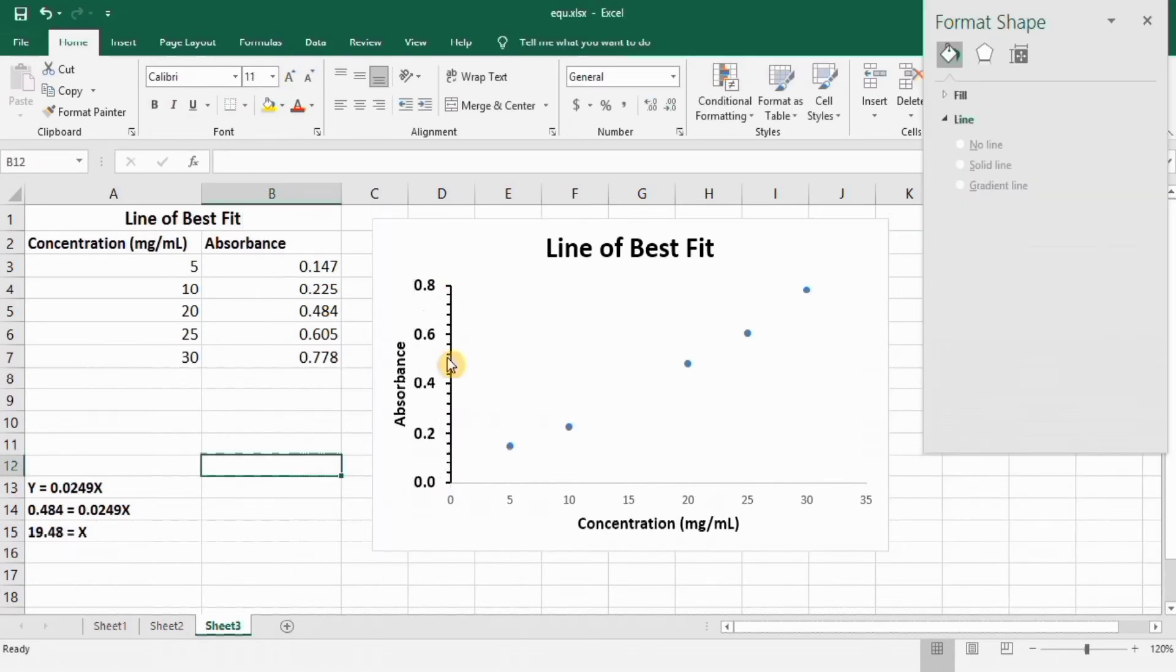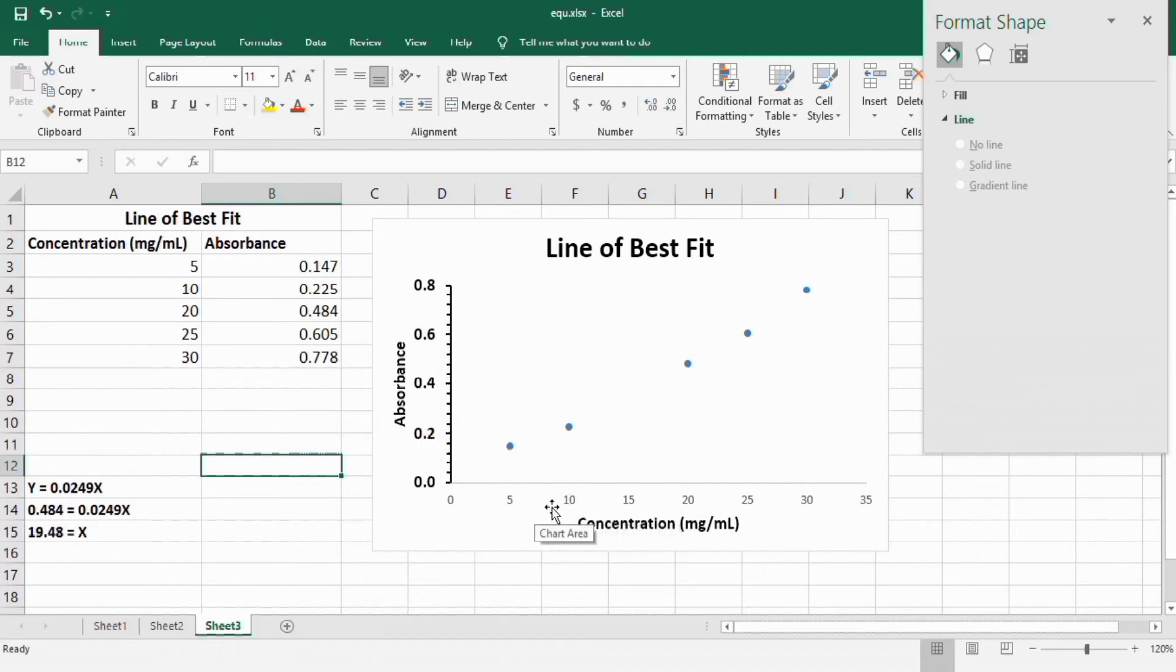You can use similar method to edit this axis, so I will not edit this axis. I will go to the marker option.